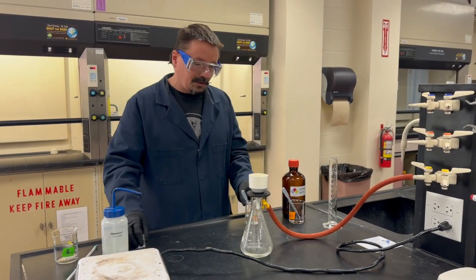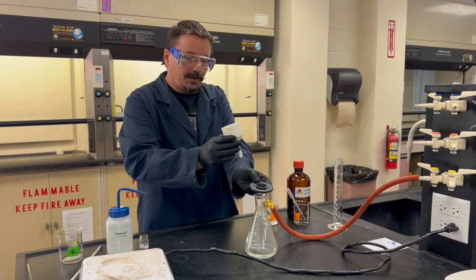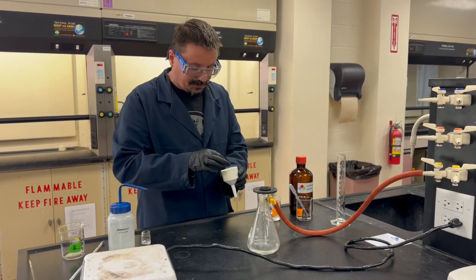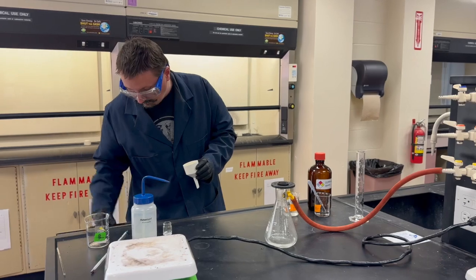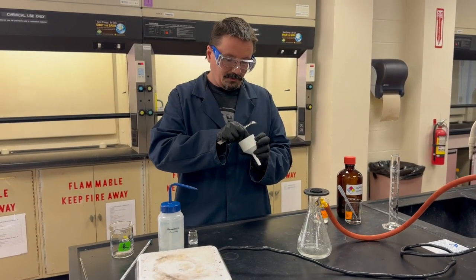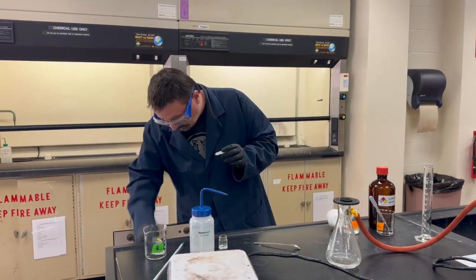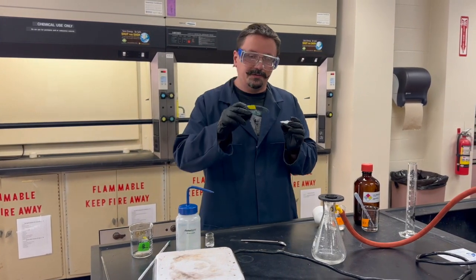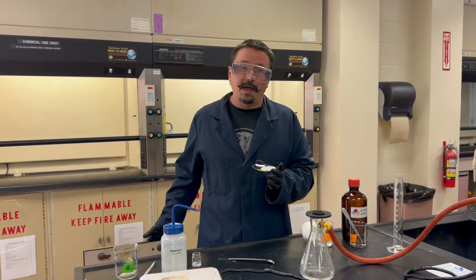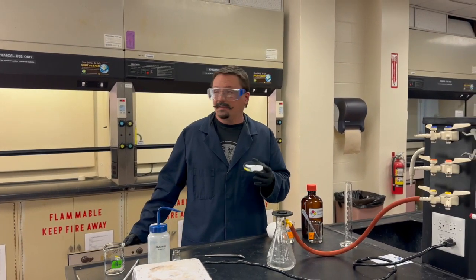Whether you need one or two passes, once you're getting clear liquid and all the precipitate is on the filter paper, let it run for a couple of extra minutes to help dry it out. Then carefully remove the filter paper, get a labeled watch glass, and place the filter paper on it. Bring that back to the oven to dry.